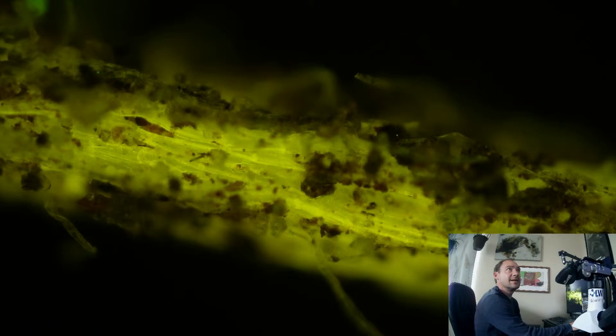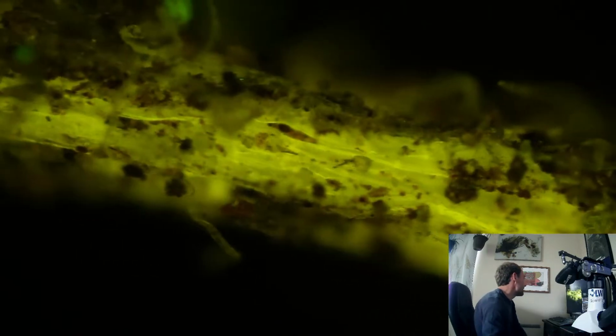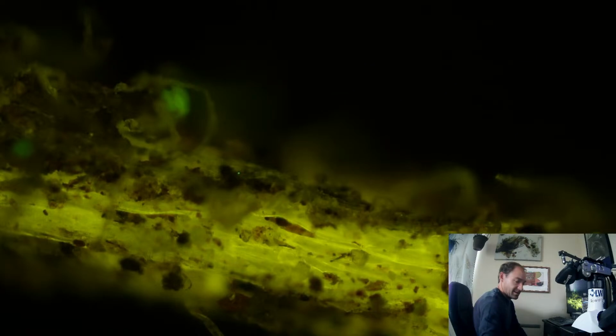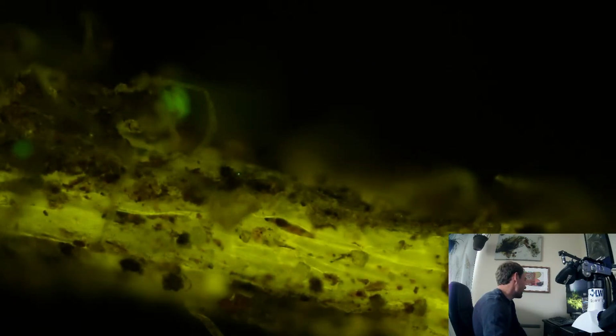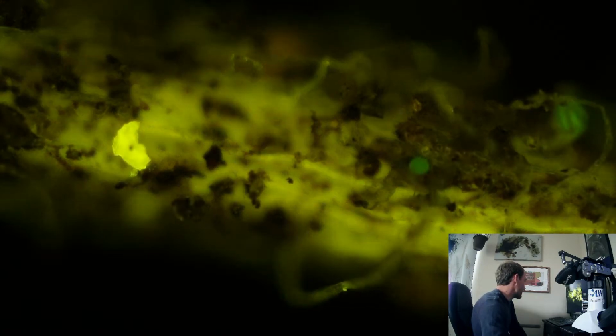Right through this area, I think we might have some mycorrhizal in there, fixing some phosphorus. Up top too, this little wavy one. See how this one just kind of waves up and around there? So yeah, even this wheat looks like it's got some symbiotic fungi growing inside the root. Super bright glowing spot there.